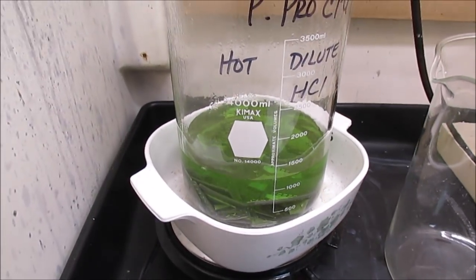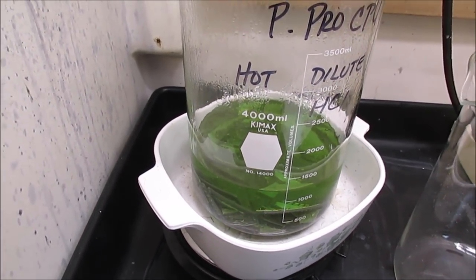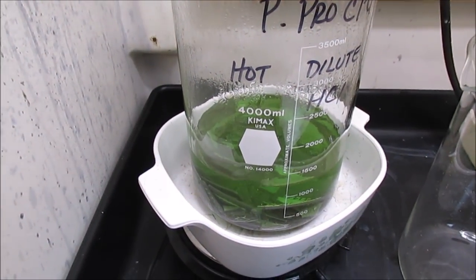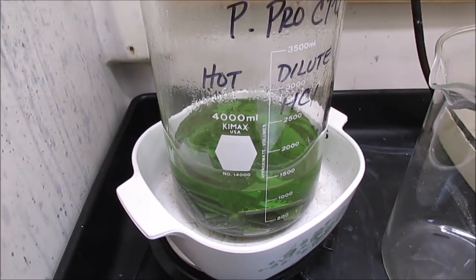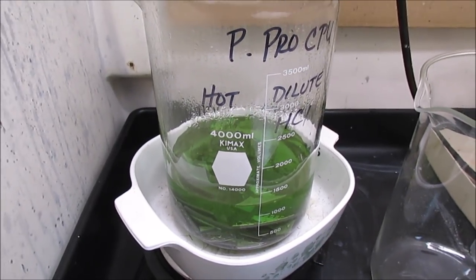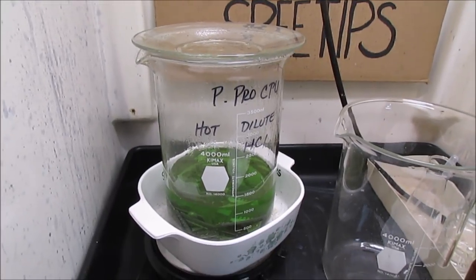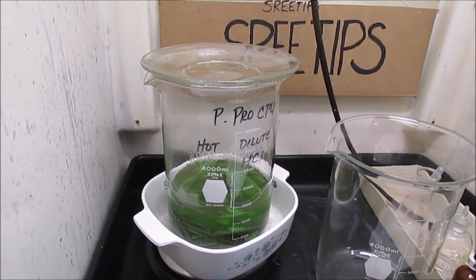We've got the remaining pieces of CPU and hot hydrochloric acid, about 100 ml of hydrogen peroxide. We're just going to go ahead and let this cook for a little while and continue on with the experiment.